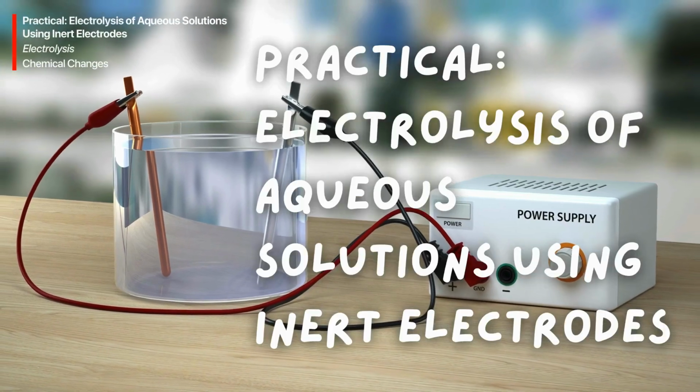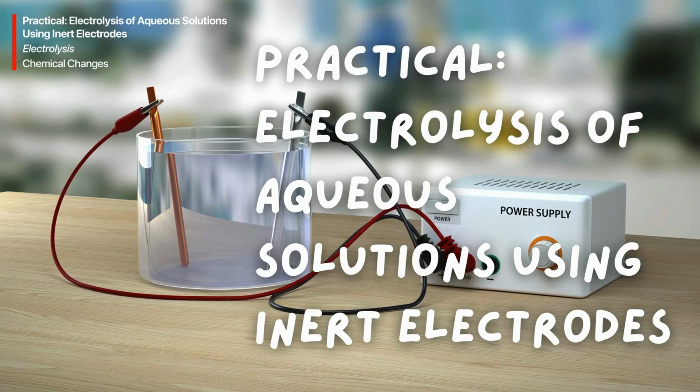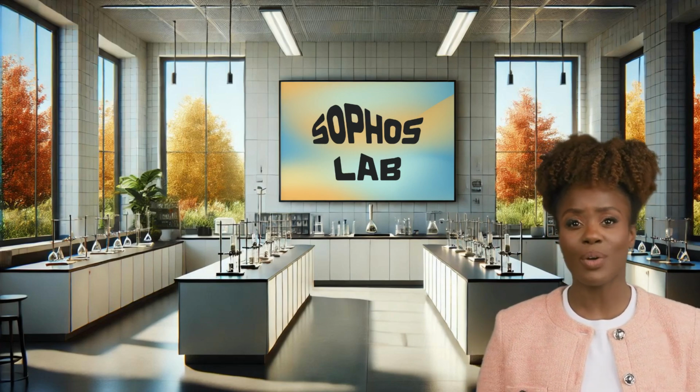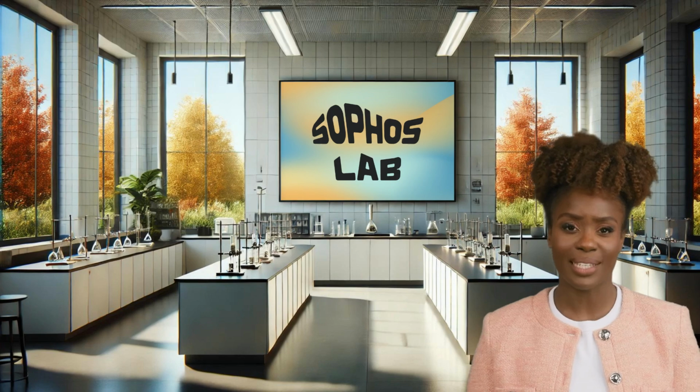Welcome to this practical lesson on electrolysis, using inert electrodes. We're about to step into the lab to explore the process of electrolysis. Specifically, we will look at what happens when we electrolyze different aqueous solutions using inert electrodes.